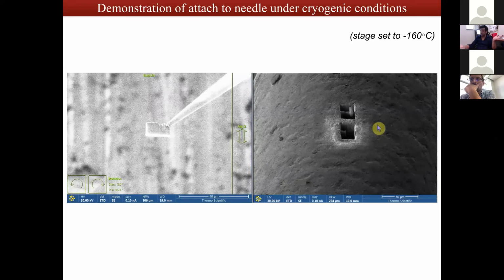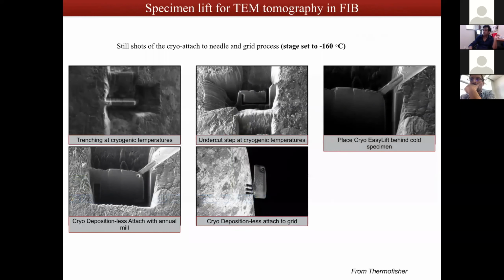Okay, now this is what it looks like. Let me show you some snapshots of this. The top three show snapshots of the movie that I've shown you before. The bottom one shows the region of attachment of the sample and how it attaches itself. There are all different kinds of techniques for that, and I'm not going into those details.